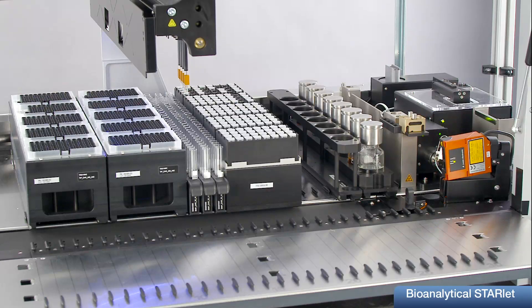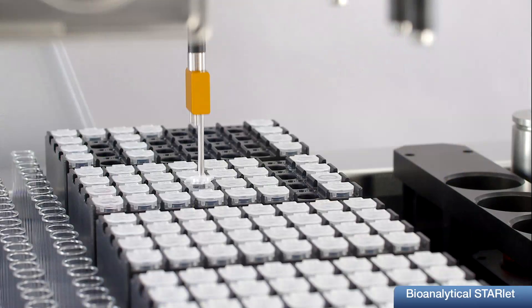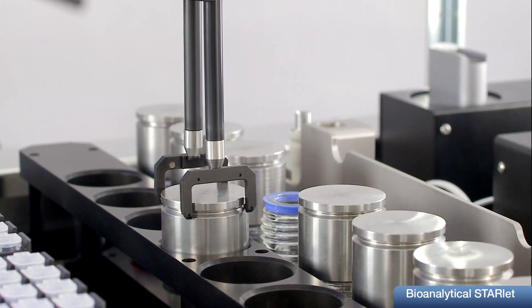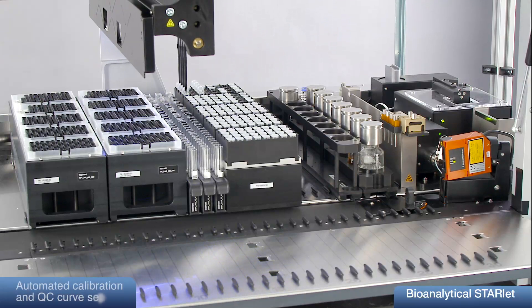The entire sample preparation is done in flip tubes which can be easily opened and closed. Volatile liquids are stored in automatically closable bottles to avoid concentration changes. Calibration curve setup is done in serial dilution steps with excellent reproducibility.